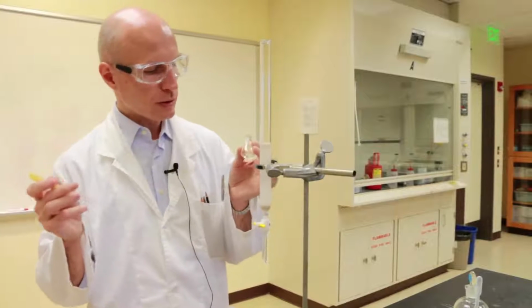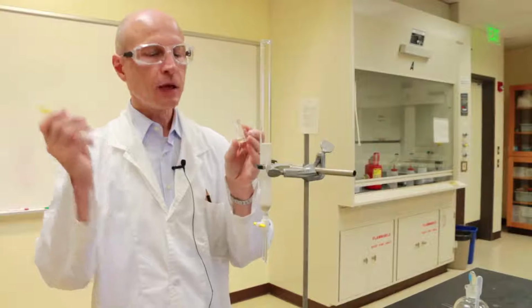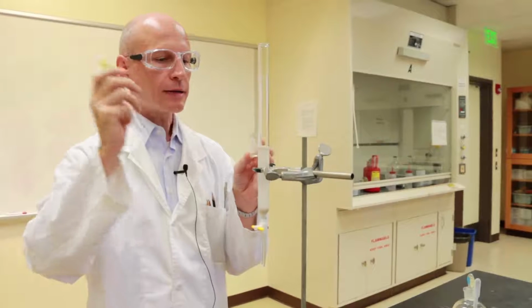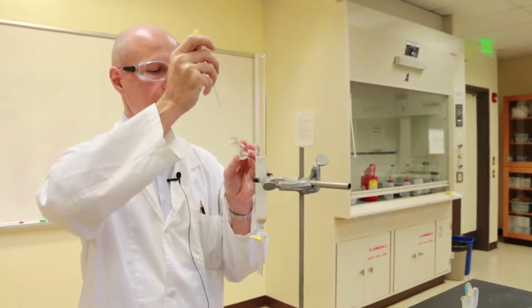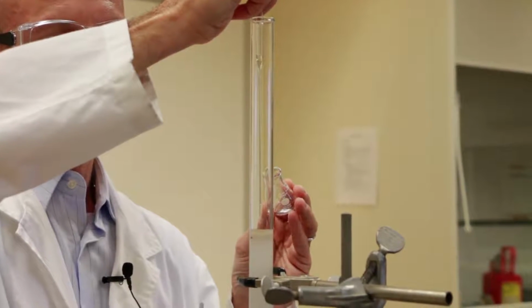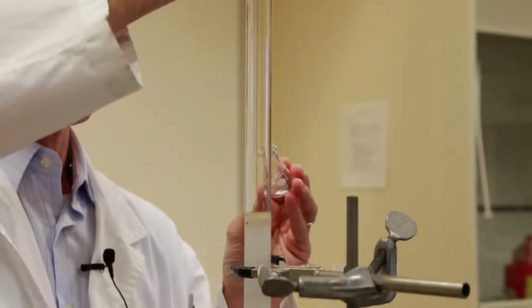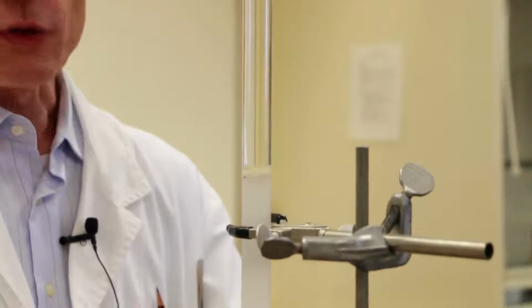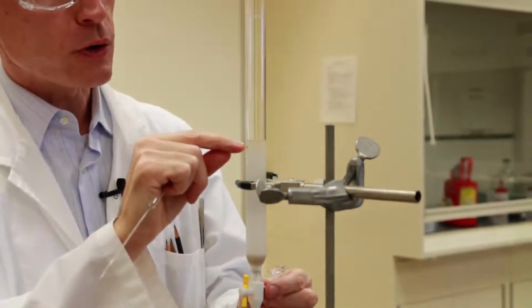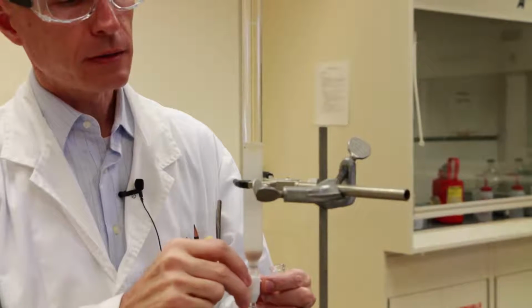Now you're ready to load your compound. In our case, the compound is a liquid, so it's very easy. You want to use a long Pasteur pipette and drop it right in the middle of the dry sand. And then you open the stopcock and you let the compound enter the column, which means you go with the sand dry. And you stop right there.